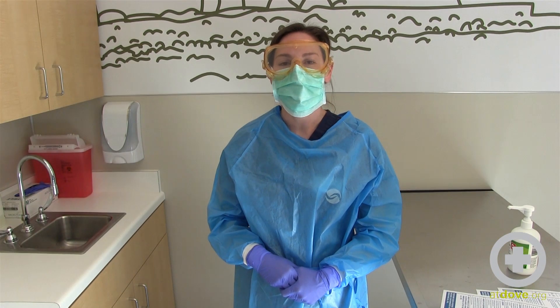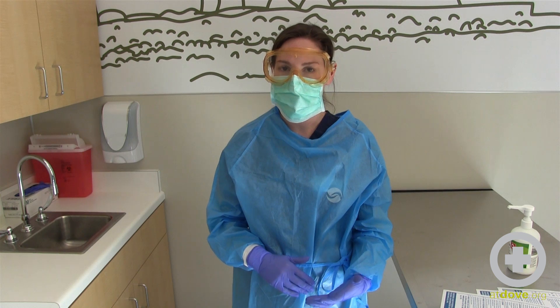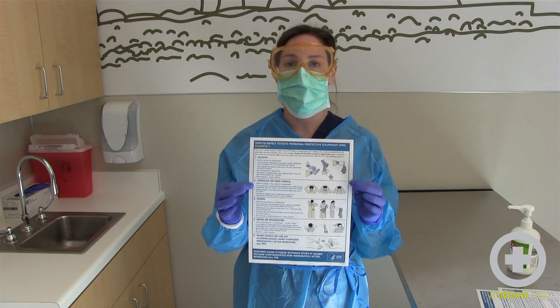Hi, I'm Jessica and I'm here at Dove Lewis and I'm going to show you how to properly take off PPE according to the CDC. There are two examples that the CDC has on how to properly take off PPE. I'm going to show you example one first.